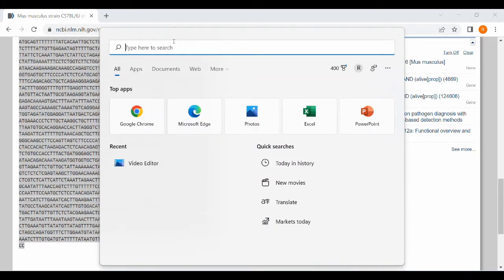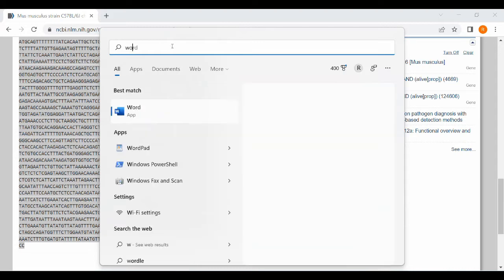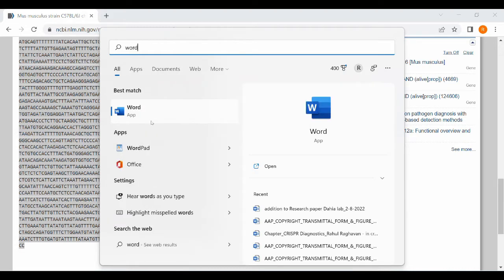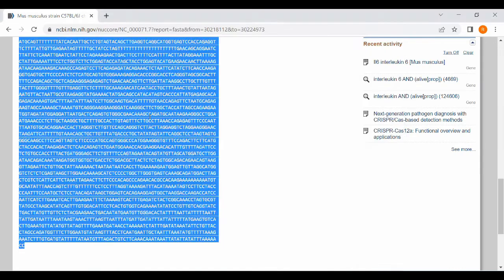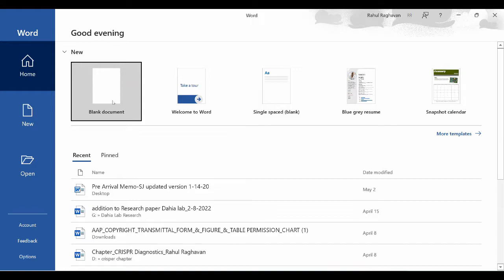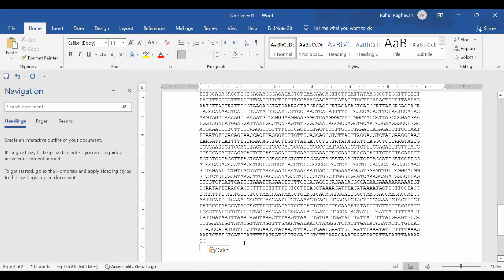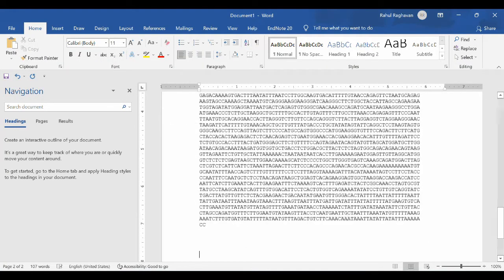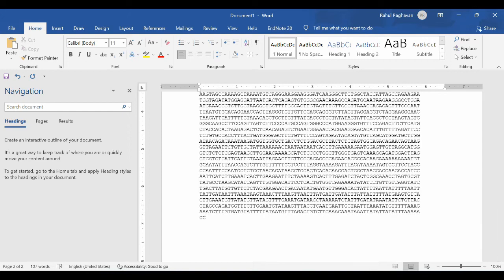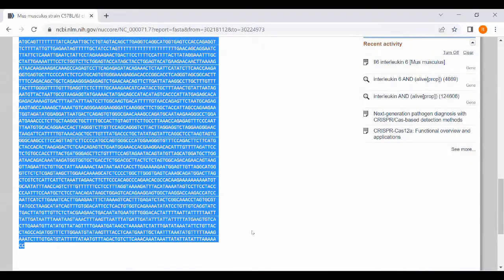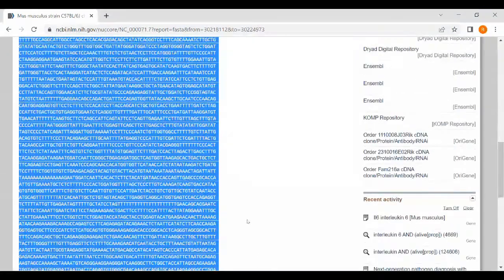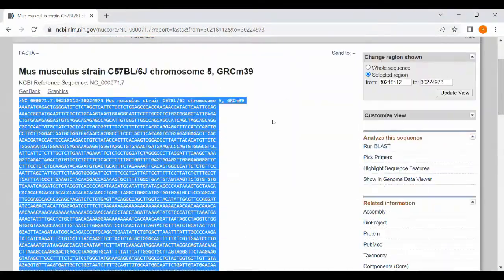The exons are the coding genes and the introns are non-coding parts. So you will have both sequences from this particular sequence. You copy paste that into the Word format.